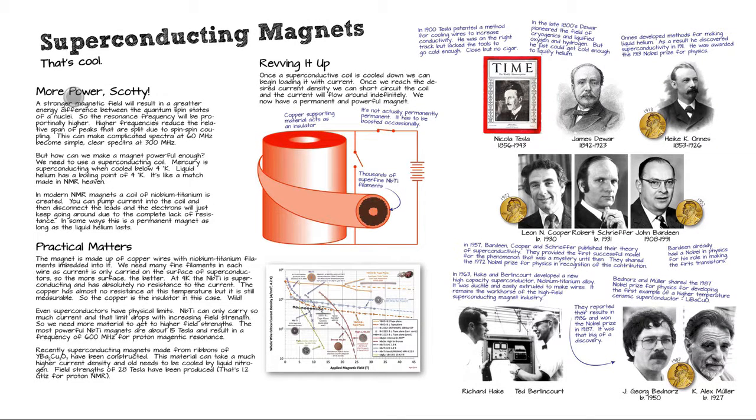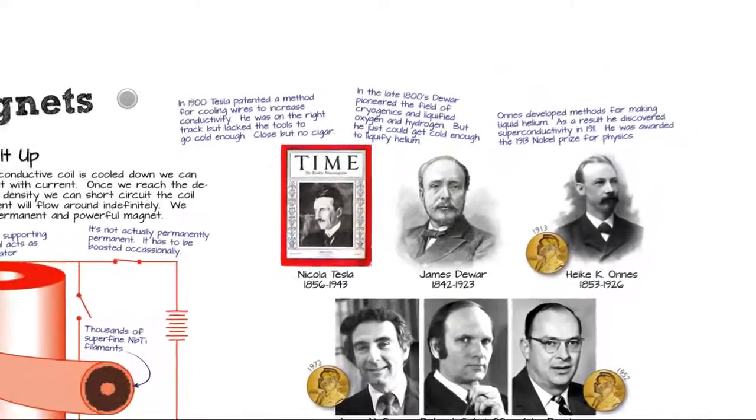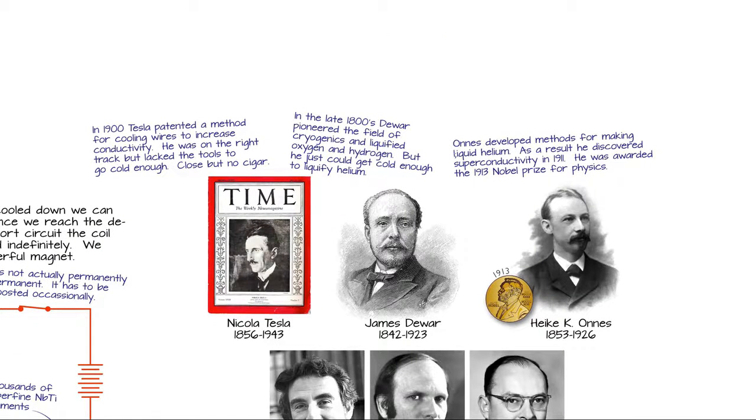Well, let's talk about how to improve our signal, because of course chemists want a better and better signal, and as we're going to see, the way to do that is a more powerful magnet. But you just can't get past about a 100 megahertz magnet for NMR. A permanent magnet really can't be made any more powerful than that. Electromagnets are not much more powerful than that because of problems with, well, physics. I can't even get into it. It's over my head. Just trust me. The physicists said you couldn't do that, and I believe them.